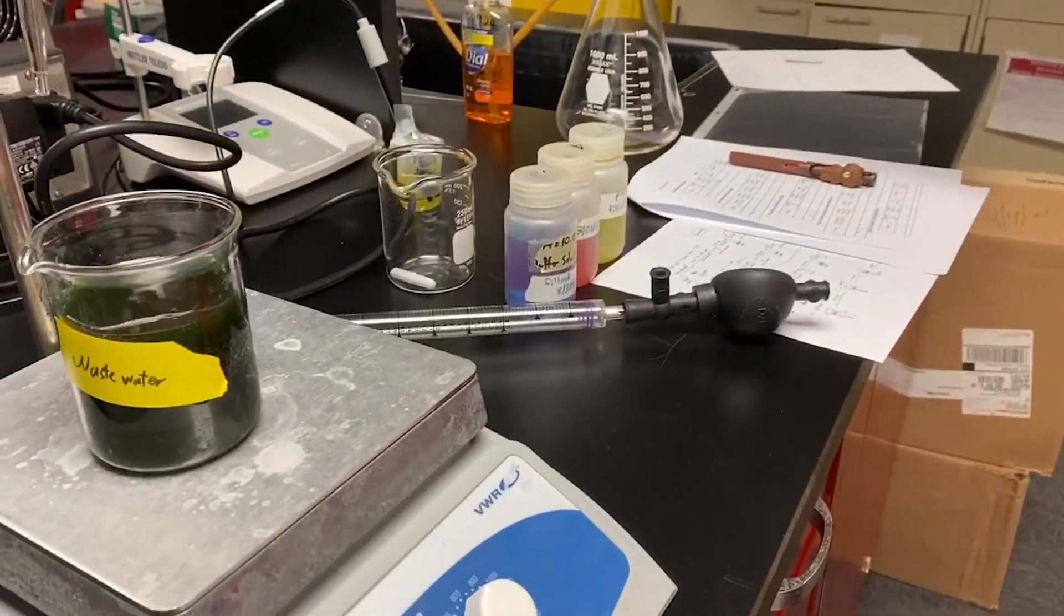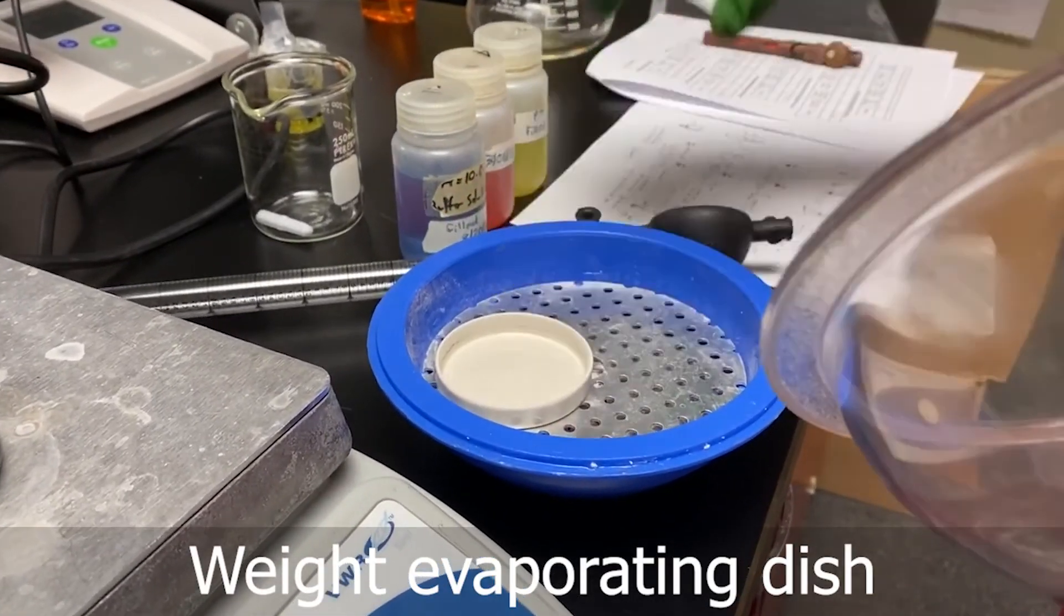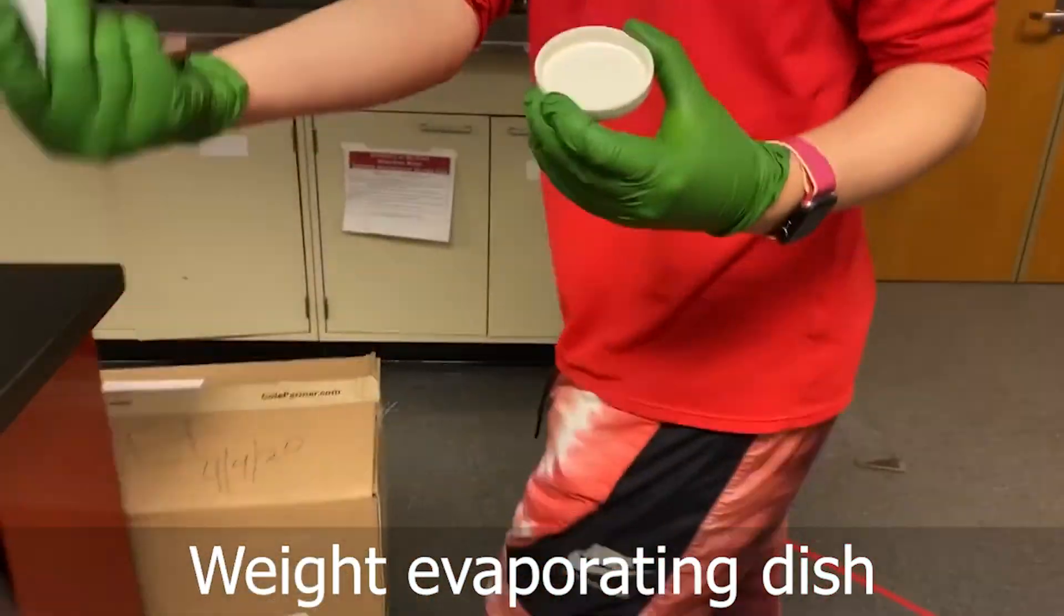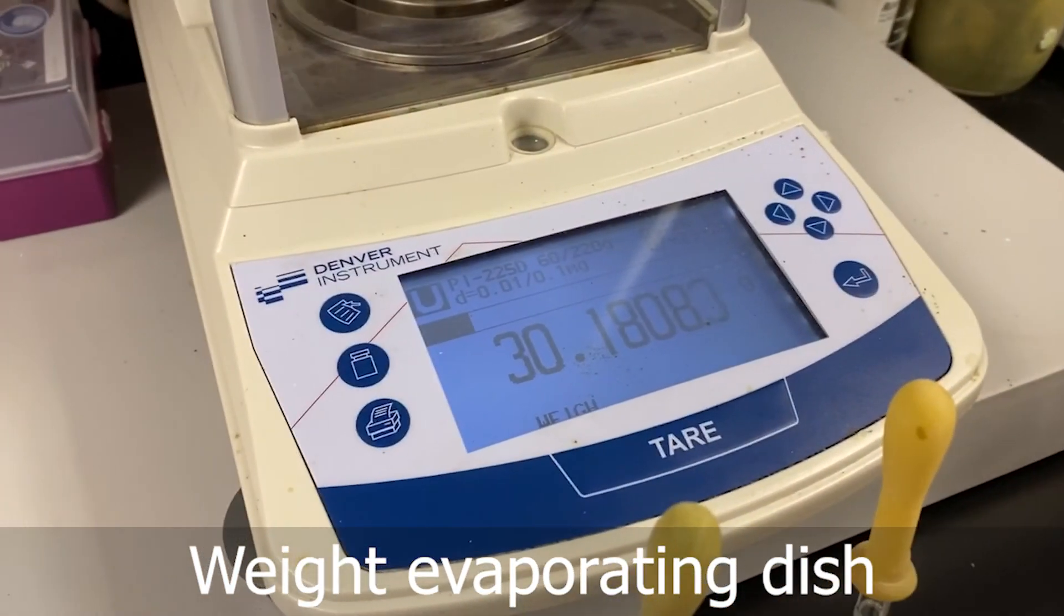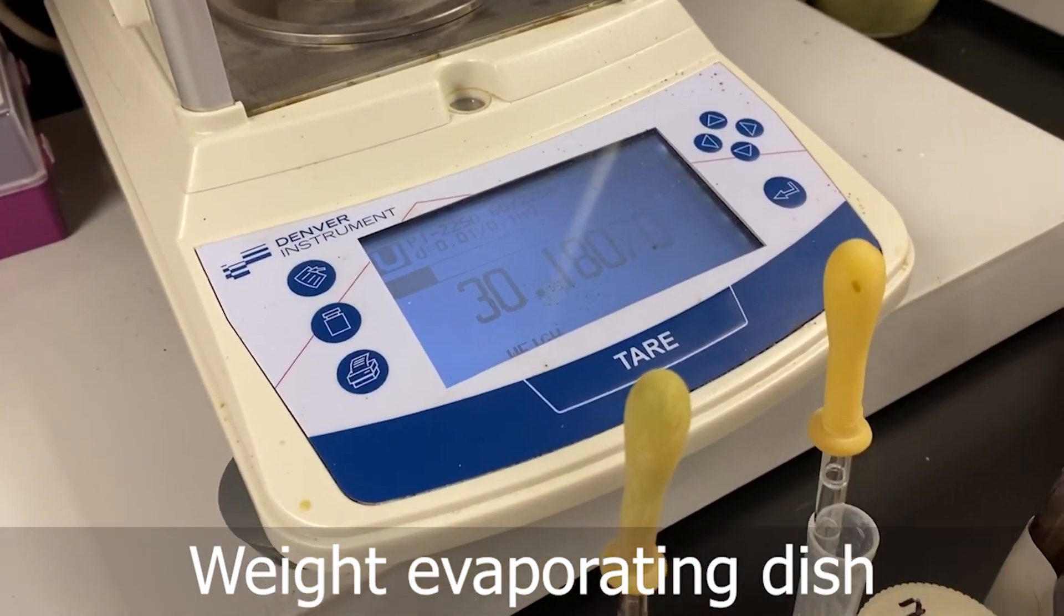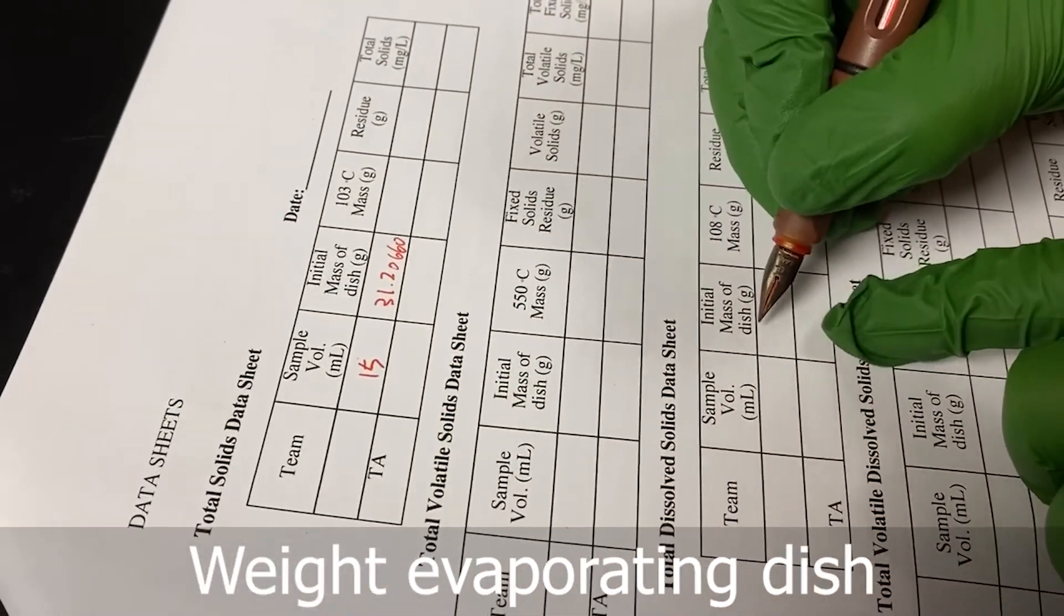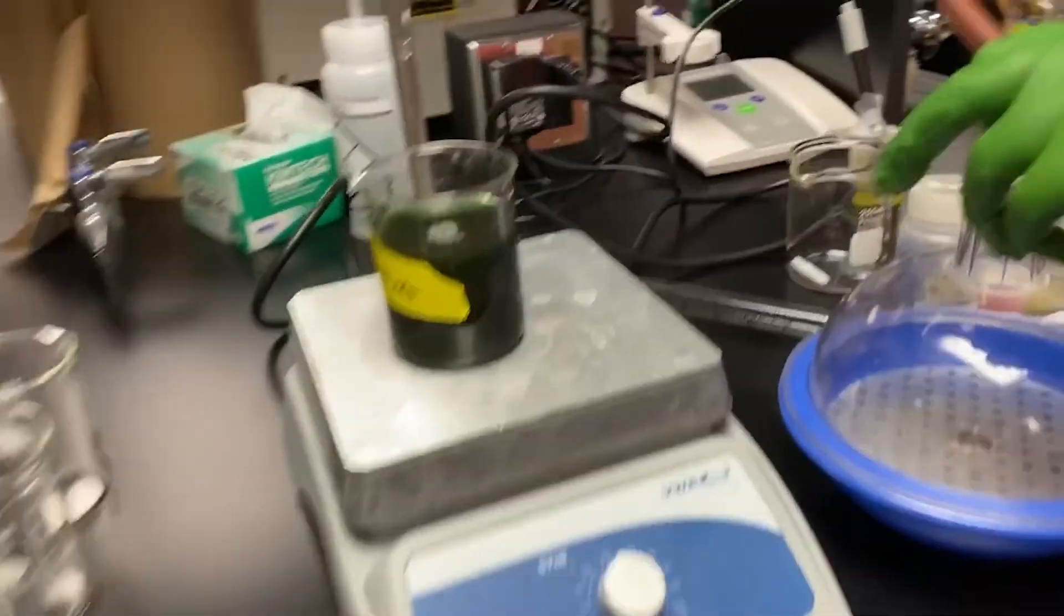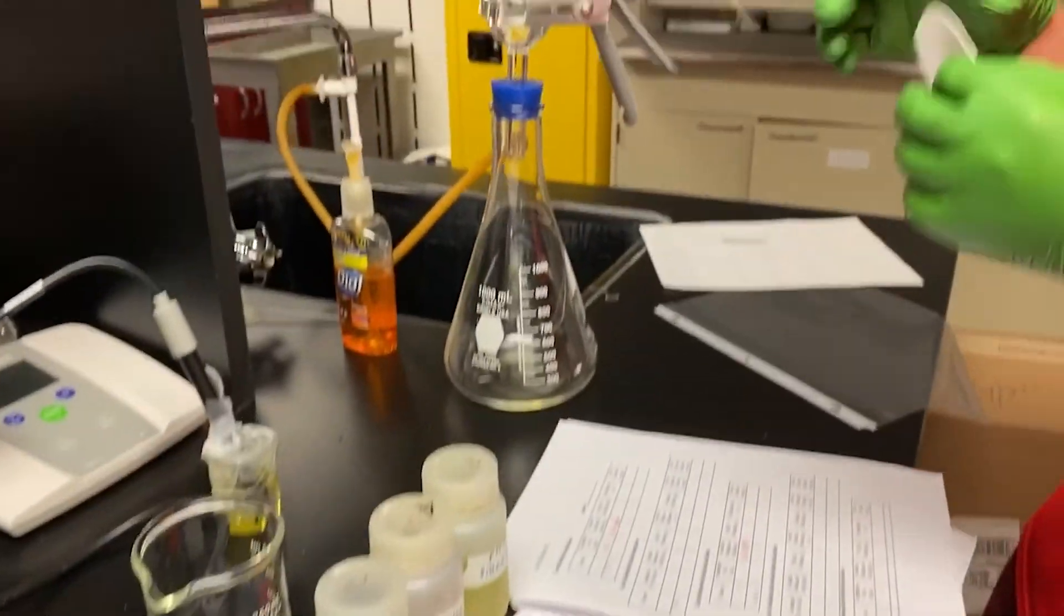And then for the next one, we are going to use the filtration for total suspended solids. We need to measure the mass of another evaporation dish and then write down the mass. Because this one is the dissolved solids, we can store it here.